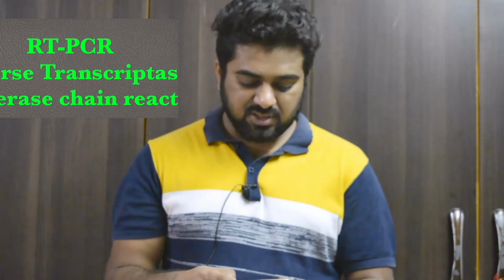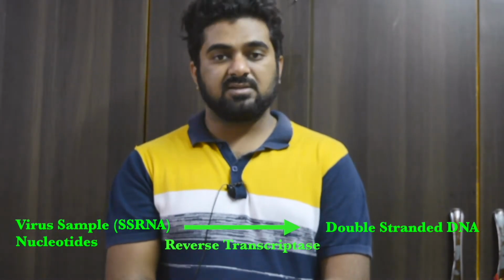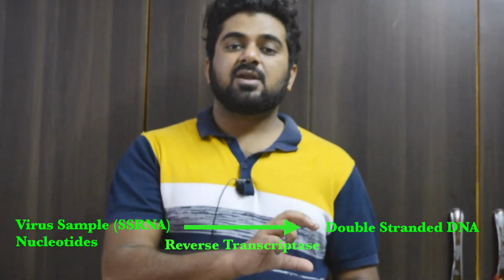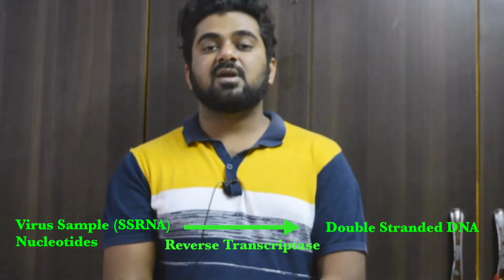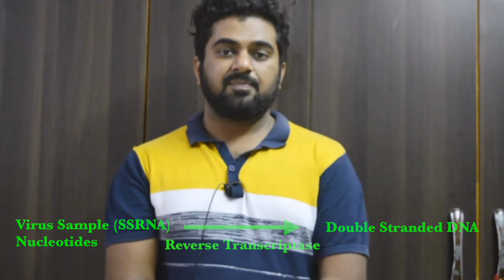Now, in the first step, we'll be mixing the virus sample with the free nucleotides and reverse transcriptase enzyme, so that reverse transcriptase will consider the single-stranded RNA which is present in the sample as a template and will synthesize the double-stranded DNA. So the first step will be the conversion of single-stranded RNA to double-stranded DNA by the enzyme called reverse transcriptase, right? Okay. Now after this step, the remaining process will be the same as in the other PCR.